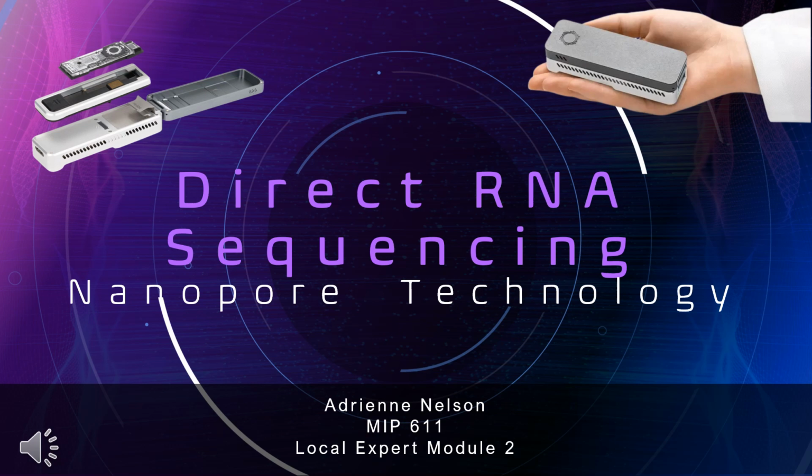For this local expert presentation, I will be discussing direct RNA sequencing using Oxford Nanopore devices. Direct RNA sequencing involves a different way of sample prep that allows you to directly sequence RNA without the conversion to cDNA. Because of the nature of direct RNA sequencing, nanopores are the only method to use if you want that kind of data.